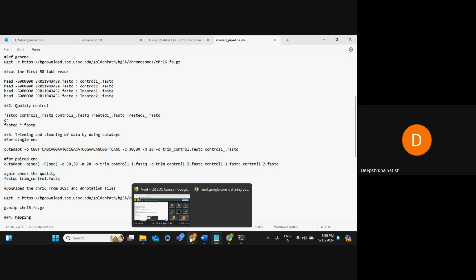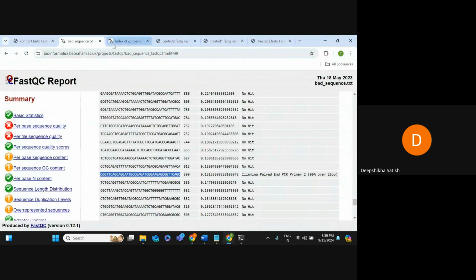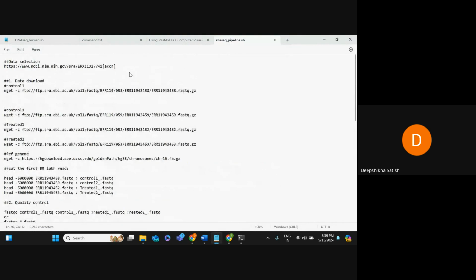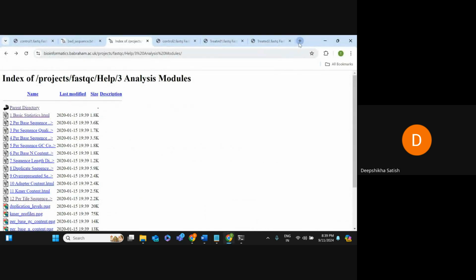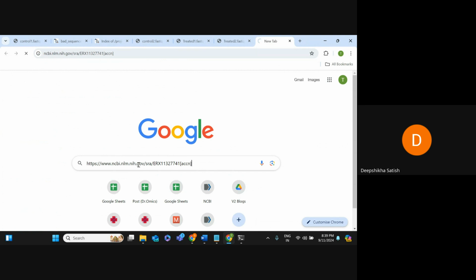So I've already studied the abstract, and that particular gene, okay. This data has been taken from human, correct?